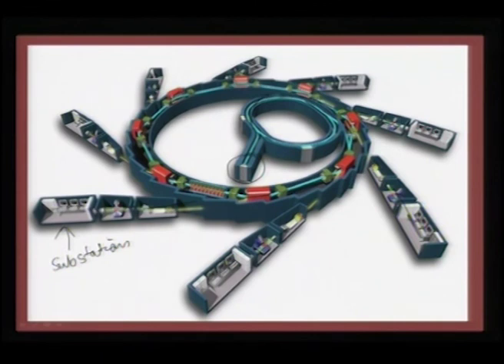These are your substations where you can bring any of your instruments. If you are interested in analyzing a particular sample, you can do that, or if you want a deposition chamber to be transported, you are free to come and house your equipment here, study for a particular time, and then you can take it back.